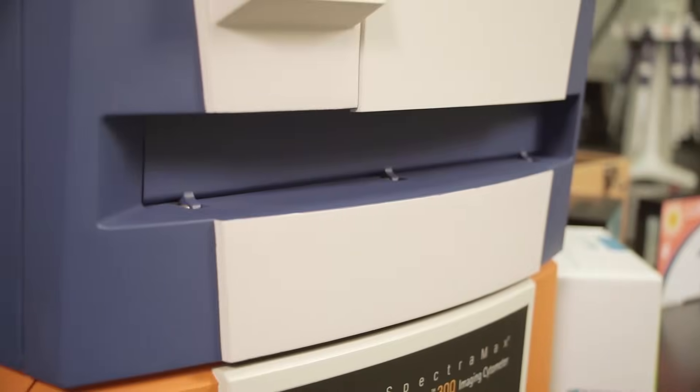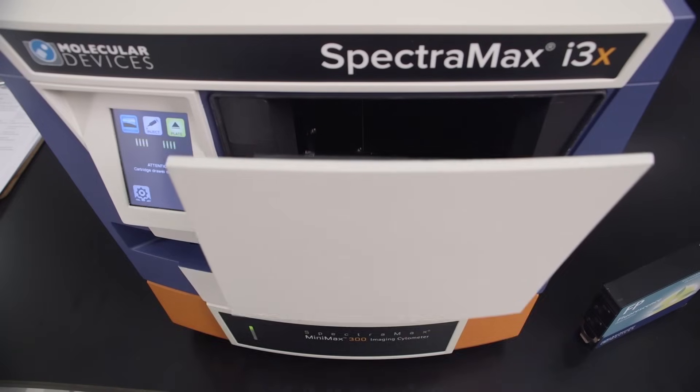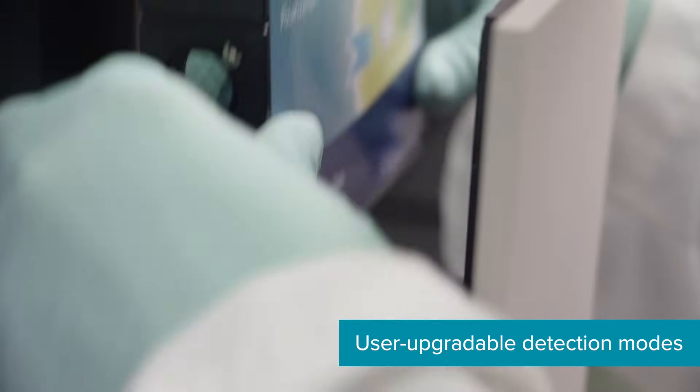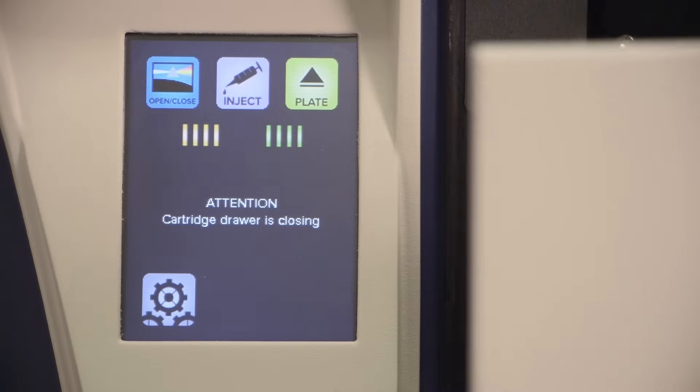Let's take a look at the groundbreaking features that set the SpectraMax i3x apart. Customize your platform with user-upgradable detection modes and functionality. Simply insert a detection module to expand your application capabilities.